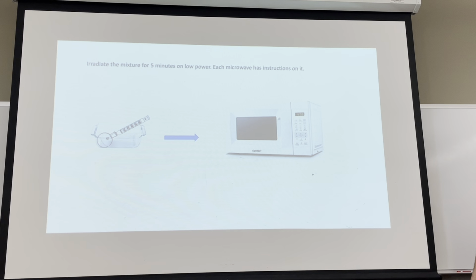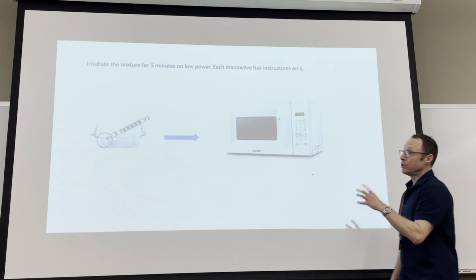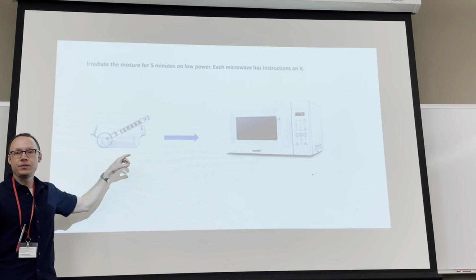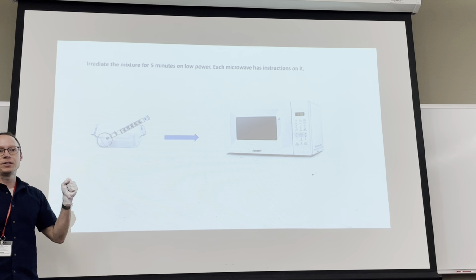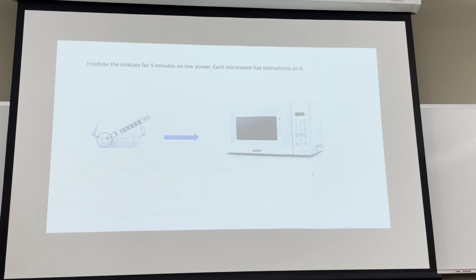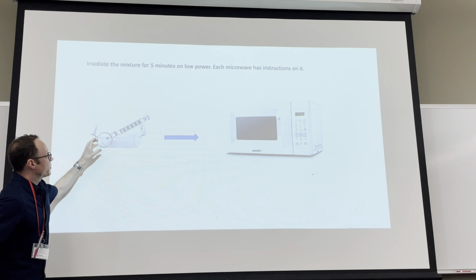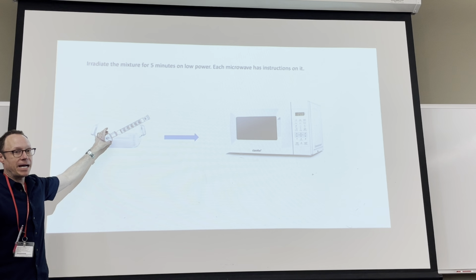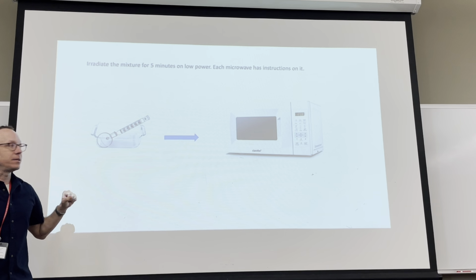So what I would recommend you do is grab one of those little orange crab claw things, and also whenever you go to grab the glassware, don't just grab it by the Vigreux column, okay? Because remember, there's nothing holding these two things together. If you just grab the Vigreux column and carry it back to your bench, there's a very good chance that the round bottom flask is just going to fall off, okay? So when you go to grab your glassware, make sure you're grabbing at the neck. Grab the round bottom flask, not the Vigreux column, right?